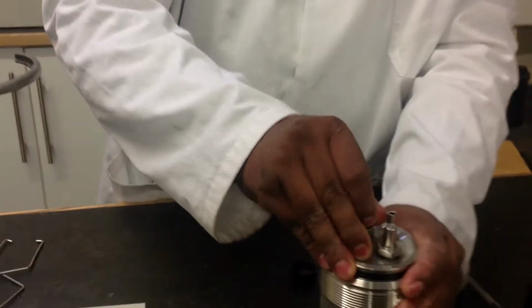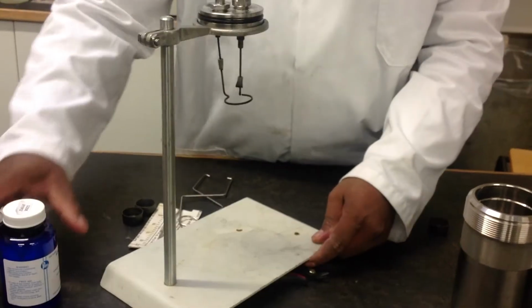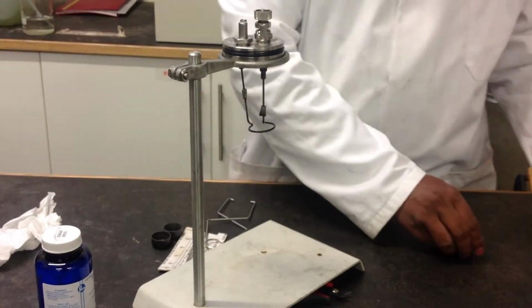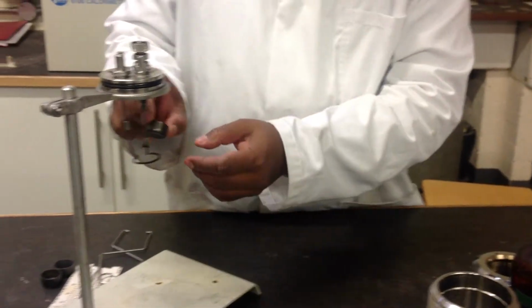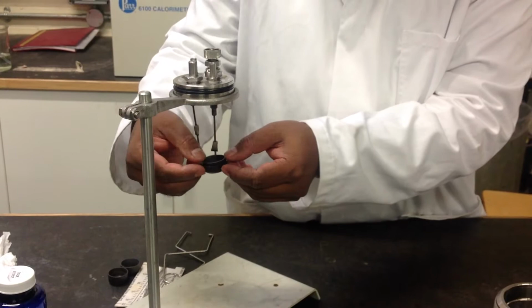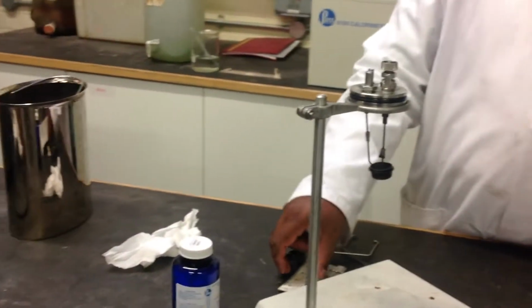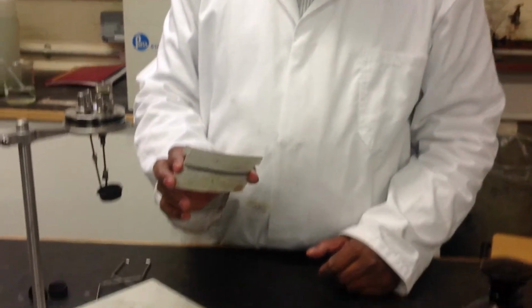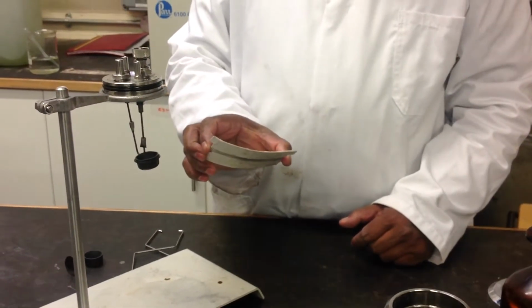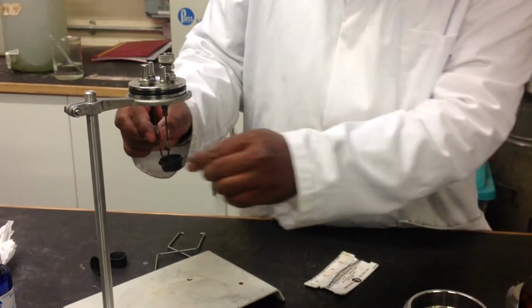If we open that vessel, we can see here, we take the sample in this crucible and put it into this electrodes loop, and then we take a fuse wire, 1 cord length, which is about 10 centimeters, and connect this fuse wire in between the 2 electrodes here.